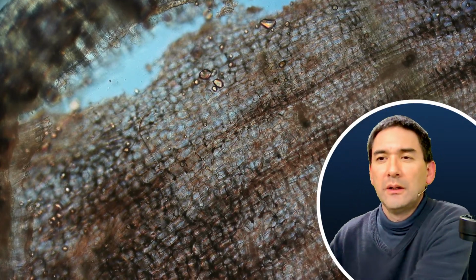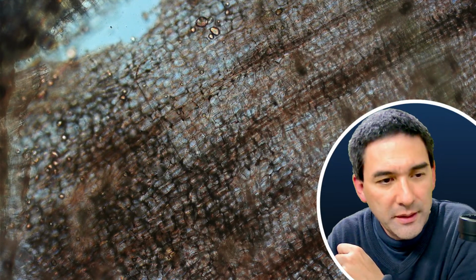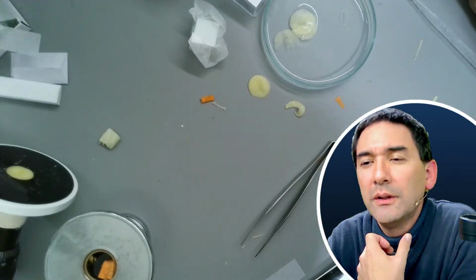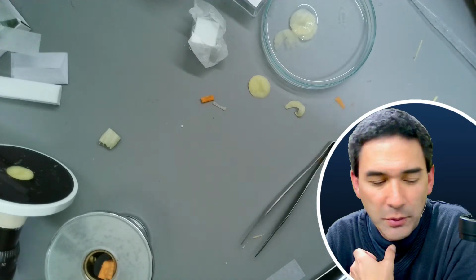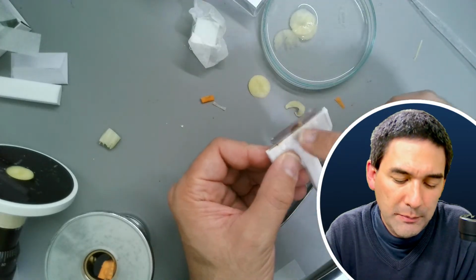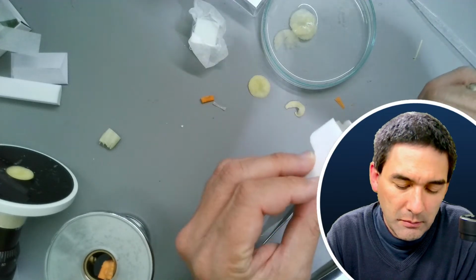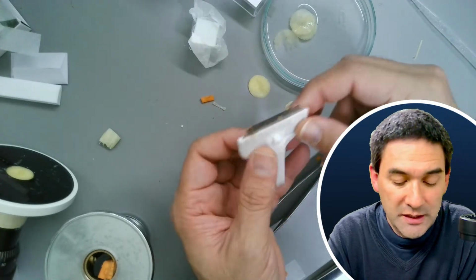Okay, so let's have another look at something here. Where is the desk view again? Here we go. So let me quickly check. Maybe trying to 3D print something that leaves a larger surface area for the blade exposed. So the idea is to have maybe another 3D-printed holder for the blade exposed. That would actually be possible. I just have to think a little bit about how, I'll just show you how this works. Ooh, this is dangerous.